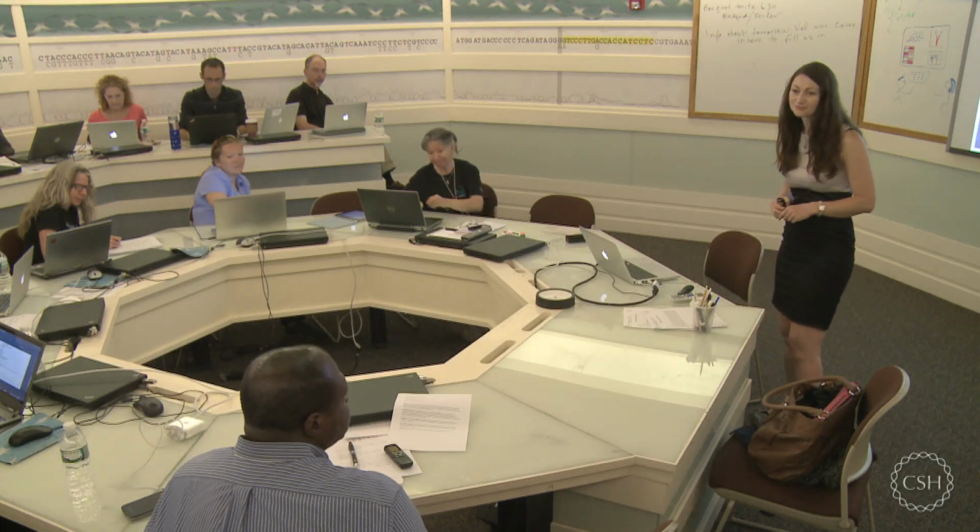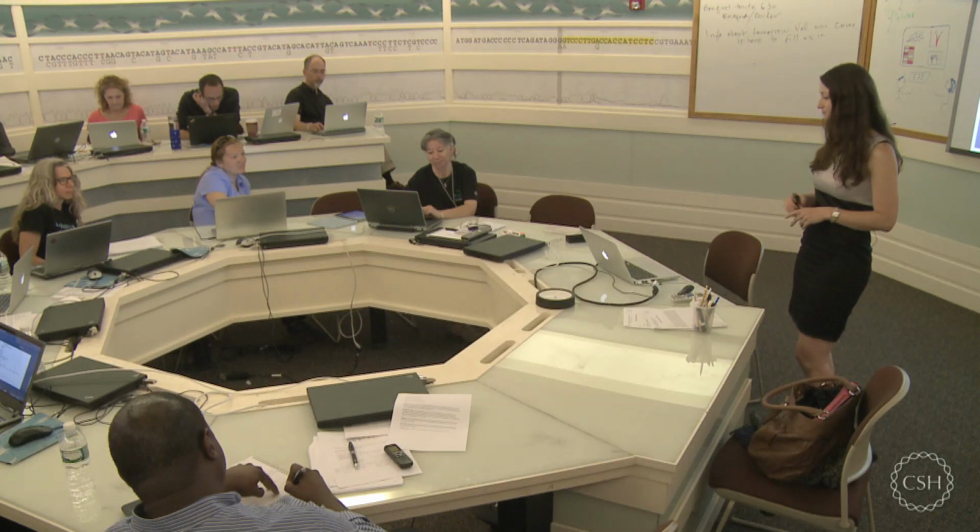Did you say what efficiency you're looking for? I would aim for 95 to 105%. If it's only 80% or something like that, I certainly would not use that primer pair.